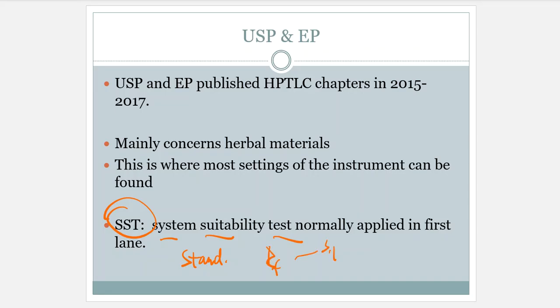As long as you use the right stationary phase and the right mobile phase and make it match, then your standard should match the trend of the data. No matter the room you're working in, no matter the instrumentation you're working with, this is a system suitability test. You are making sure the system is suitable for what you need.